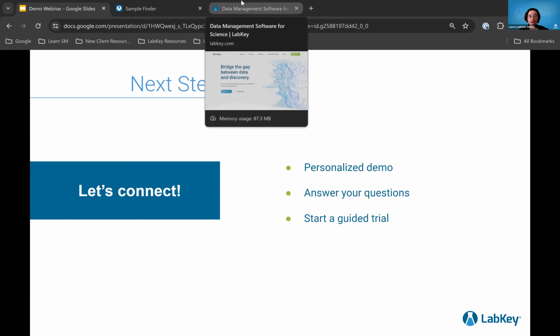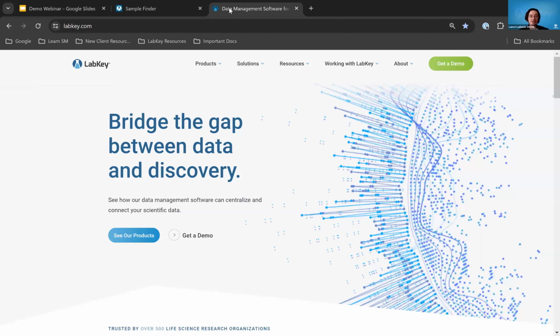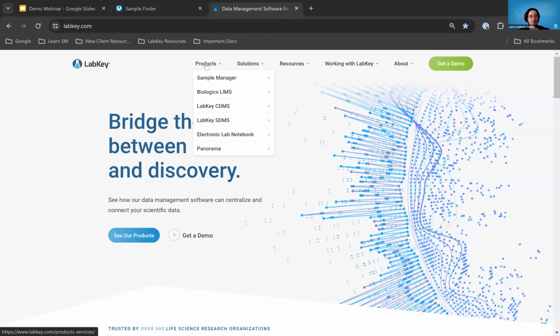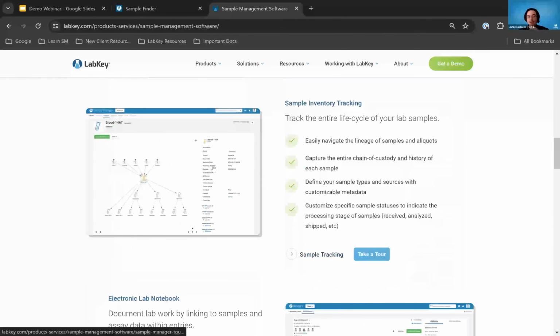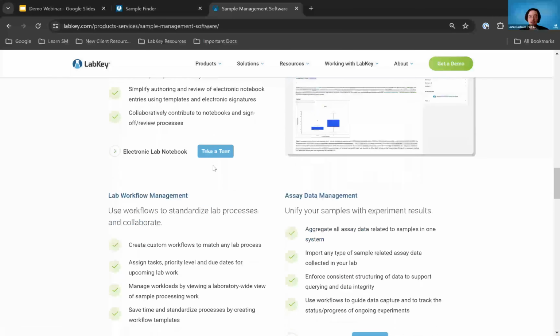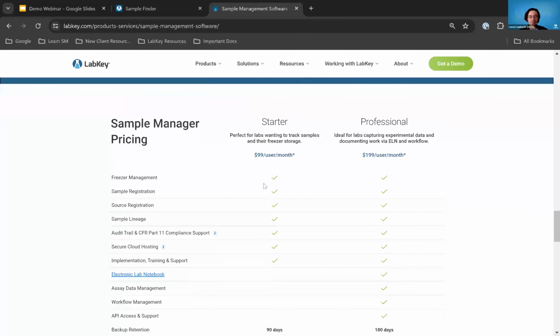So with that, I am going to go ahead and open up the floor for more questions. But if you want to do some more research on your own, our website's a great place to look. You can go to our Sample Finder or Sample Manager page. We have our pricing listed. We want to be as transparent as possible for you, and that way you can make sure this is within your budget.